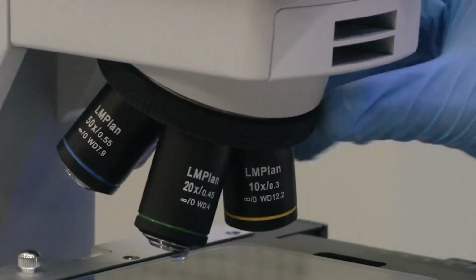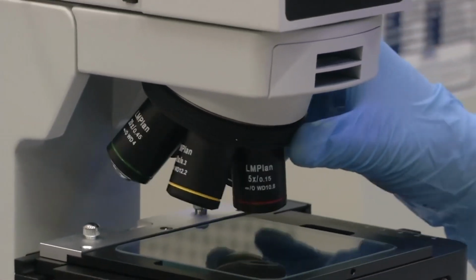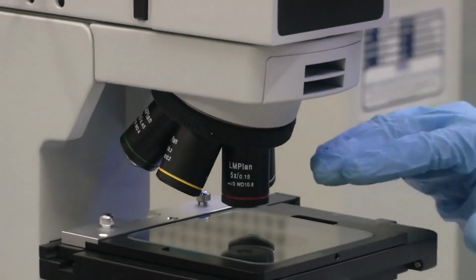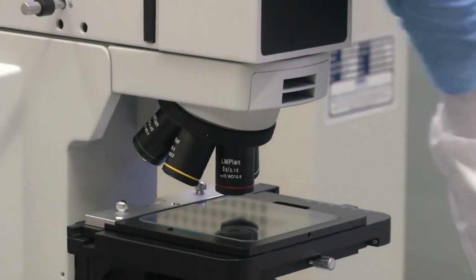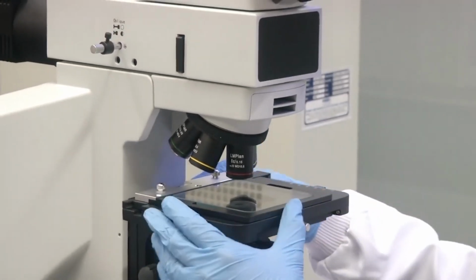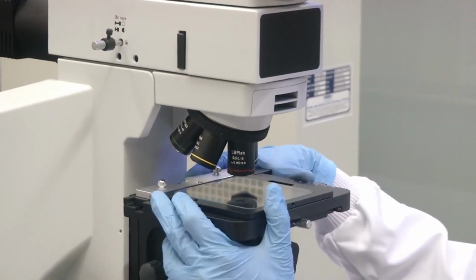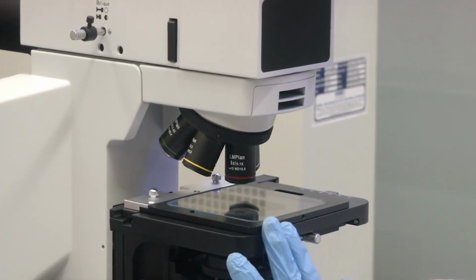Once we decide what magnification we need, we will keep the objective lens at that magnification, insert our sample on the sample holder, and then look at it through the eyepiece. Now the sample holder, I think you can see the sample holder. You had seen the stereo microscope before. Compared to the stereo microscope, this sample holder is much more complex equipment.